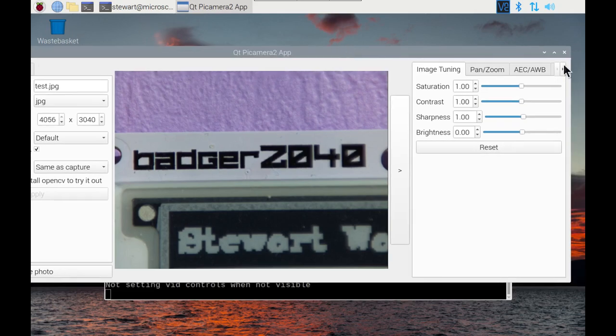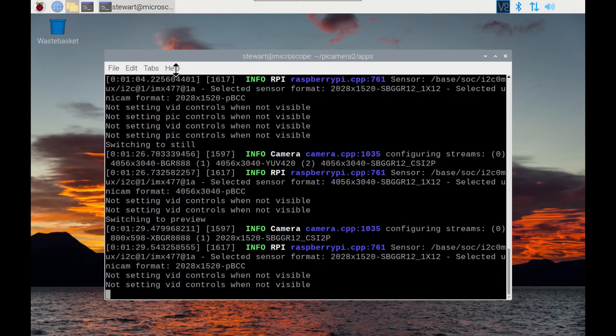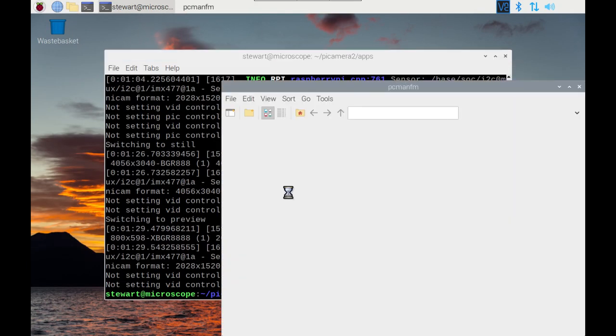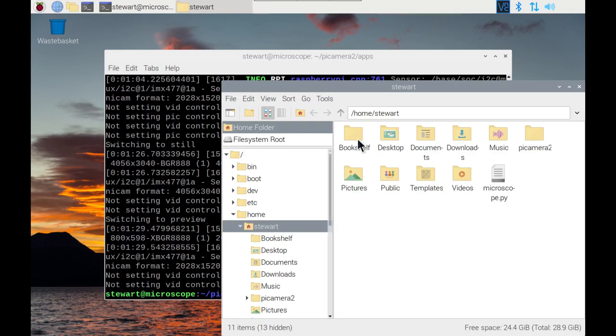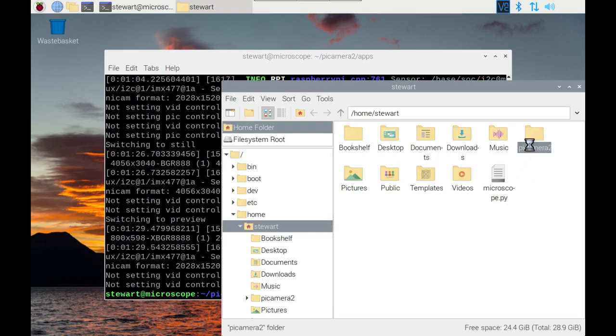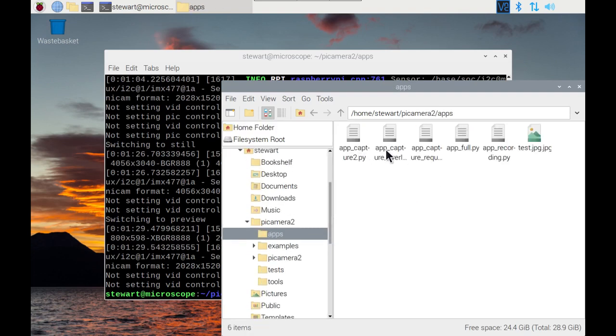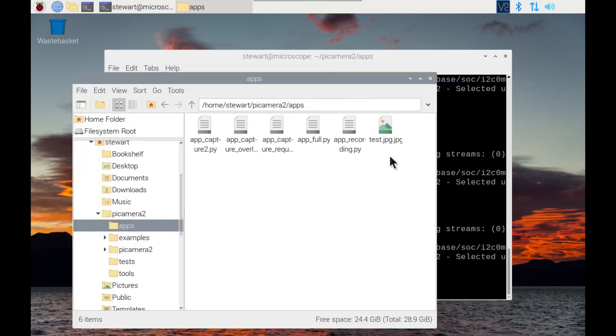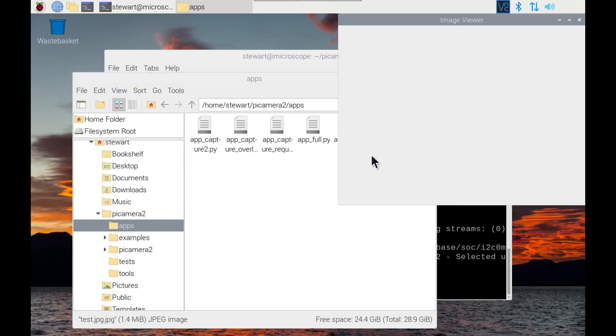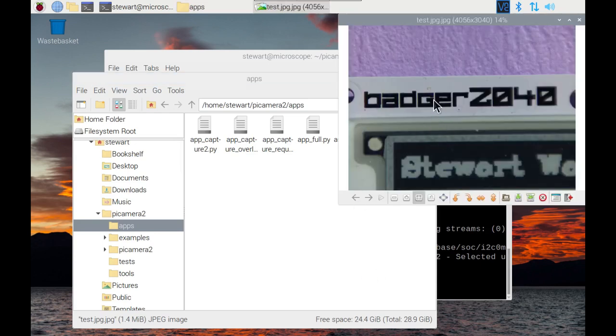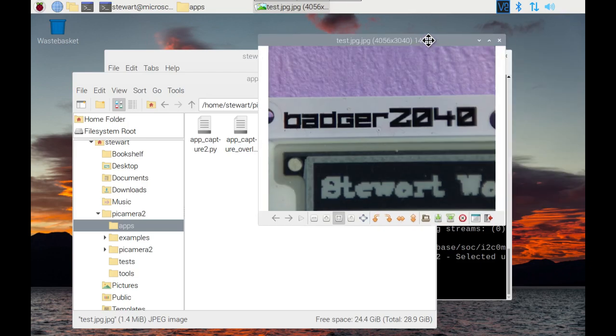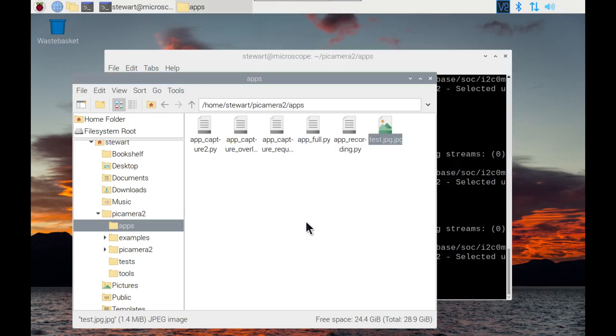And if we close that, the photo was saved in the directory that we were in. I didn't need to put the file extension on, but there we go, so that's captured that photo. And that's quite useful.